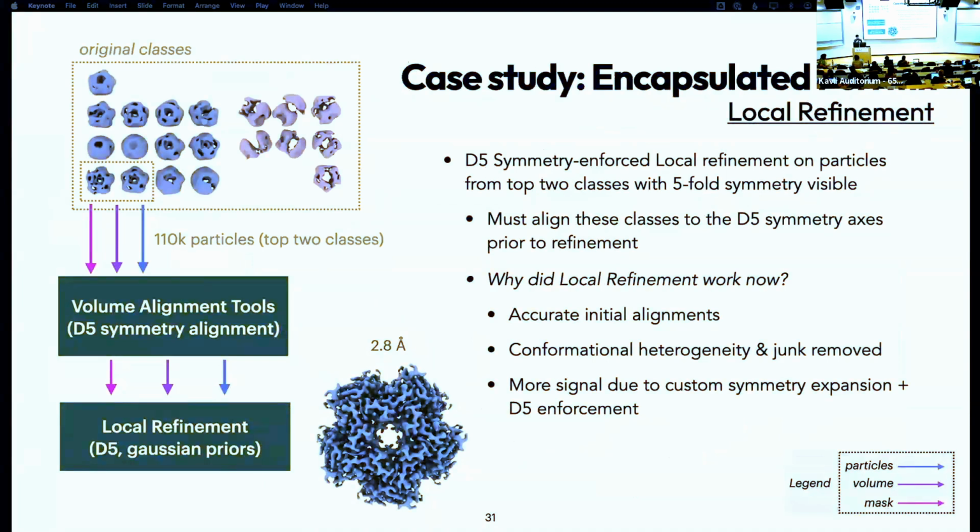So early in the workflow, the orientations were quite poor and likely too far away from their optimal values. But resolving this internal orientation discrepancy using the group realignment was crucial to improve these orientations. Because here you can see, without even doing anything before, it seems like we've actually started to get the five-fold axis in the right place and the symmetry resolved. Before we weren't seeing that. And so this group realignment step allowed us to put particles back into register before the reference was high resolution, to allow doing this on a per particle basis, which is what we hoped the initial local refinement would have done, but didn't.